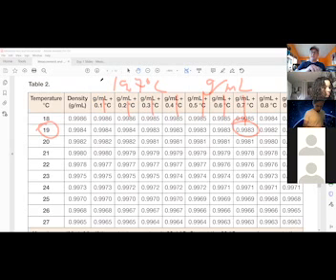So does everyone see how you use the table? And if you can't use it, like for instance, I can't use the table, I'm just going to look up what the density of water is at 15.6 degrees. See, I'll just look that up. Just go density of water, 15.6 degrees C, and bang, it'll tell you what it is. That's the nice thing. Like 30 years ago, we didn't have to do that. We'd have to look up a table in a book. So we don't have to do that anymore, which is pretty sweet.